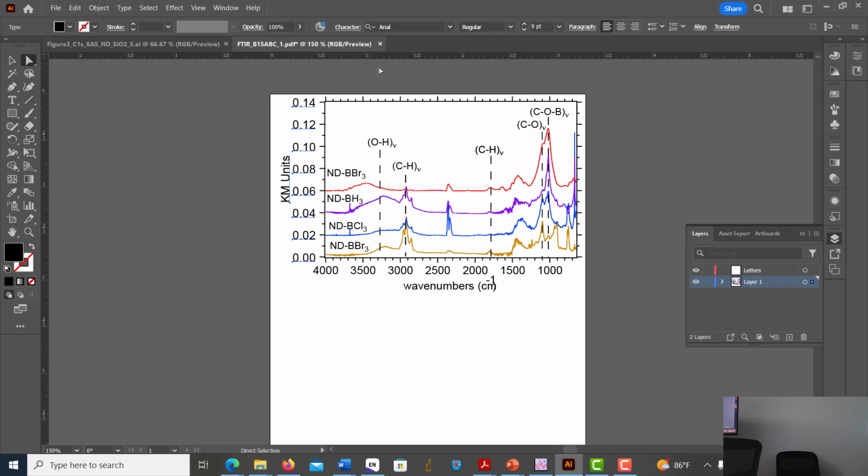Now, you might notice that you don't need that many numbers there for like 0.00. We could go ahead and just change that to 0.0 or 0. And then we kind of bring it over there. But you'll notice it's not aligned.